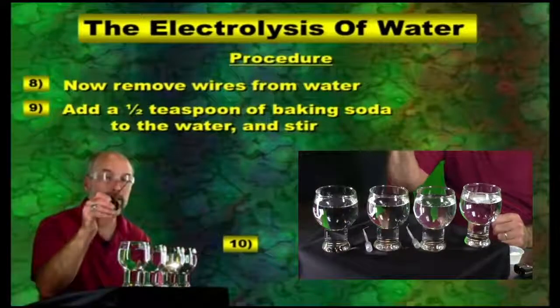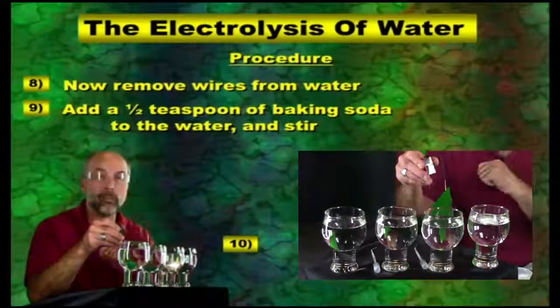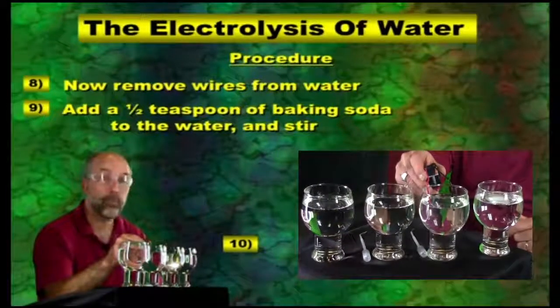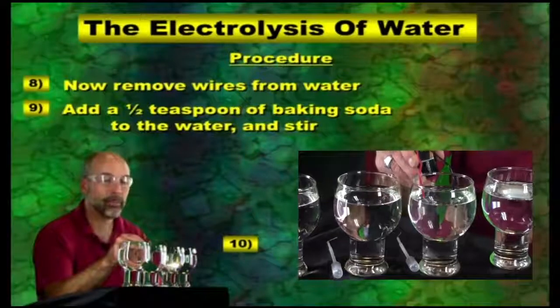So now we go ahead and take these same wires. I don't have to really rinse them off or do anything. Why? Because I had it just in water beforehand. So I'll set it in here. And now we begin to see bubbles. Look at that. Now that's pretty cool.